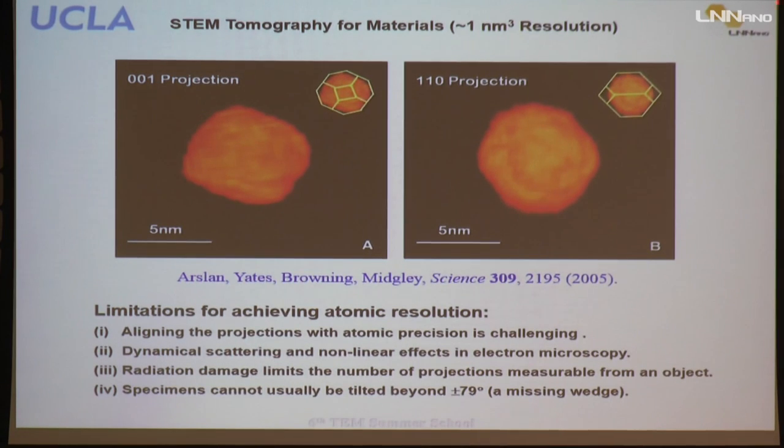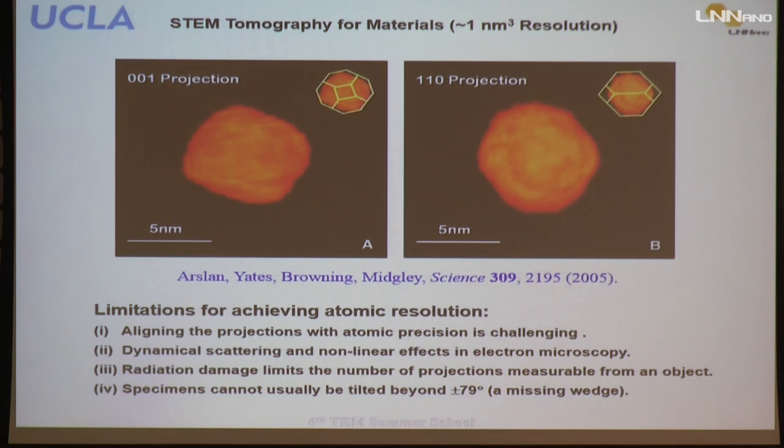Tomorrow I will talk more about the STEM tomography I'm working on. There are a lot of limitations for achieving atomic resolution, and I will explain how we attack this problem and what the result is.